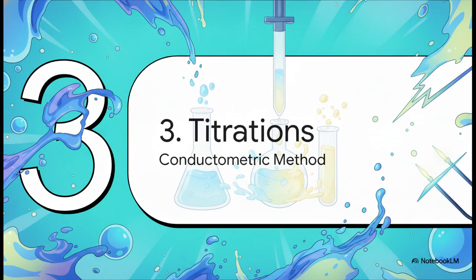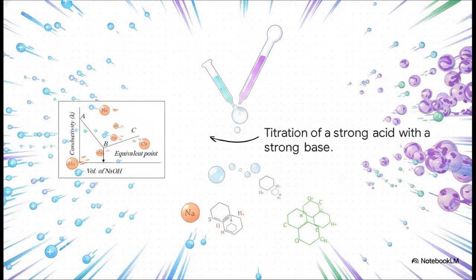Section 3. Conductometric titrations. Moving from hardware to methodology, let's observe what happens when chemical solutions actually battle for dominance. Let's map out one of these chemical battles.